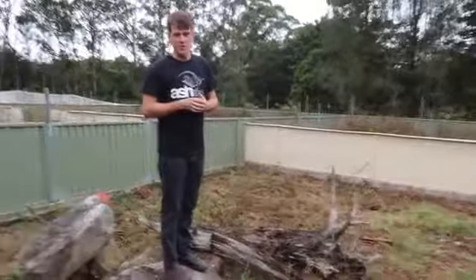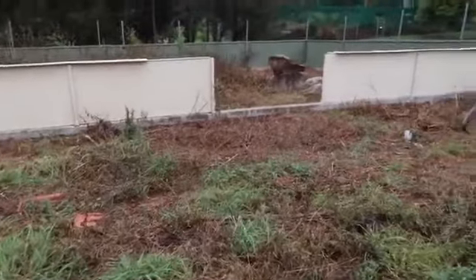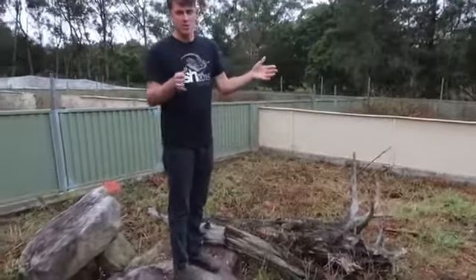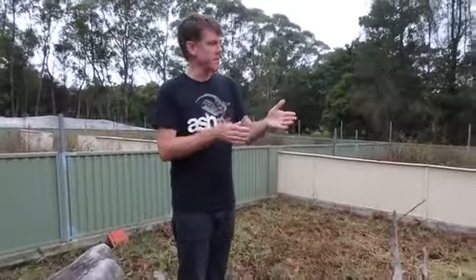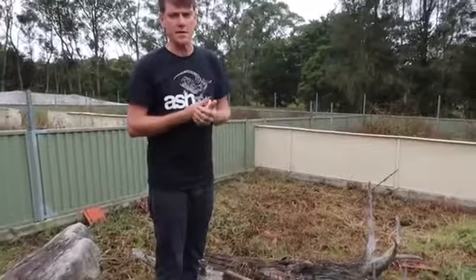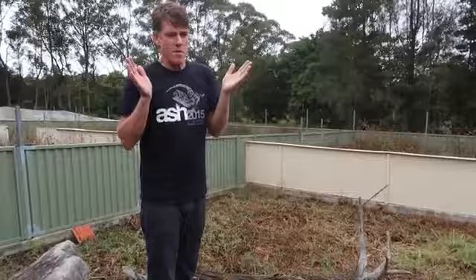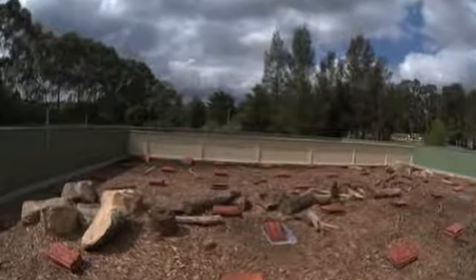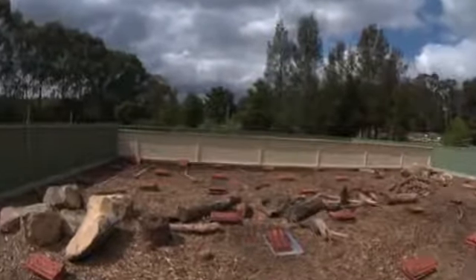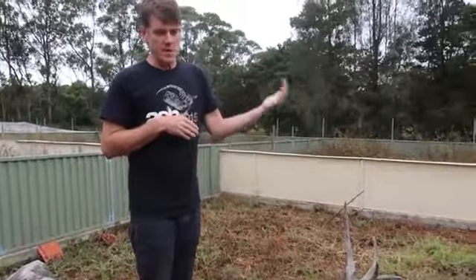So in the past we've done a big study on mating systems in water skinks, in Eulamprus kosciuskoi. So we had a large number of males and females in each of these 6 enclosures, and we had measurements on their physiological performance, so things like sprinting ability and endurance, and we studied their reproductive tactics.